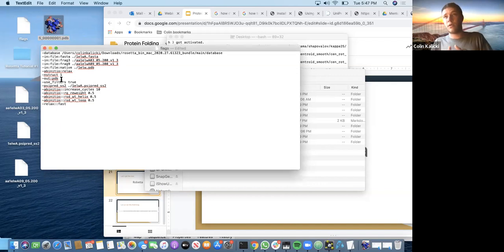If you run it actually, you're not gonna want to output it as a PDB, because you get 25,000 PDB files. And you don't want 25,000 PDB files because most of them are useless. So you'd output it to some silent file, and the silent file would just collect all the files. Again, I'll show you that in maybe a separate lecture. We'll do it together. But this is just kind of getting familiar with Rosetta.